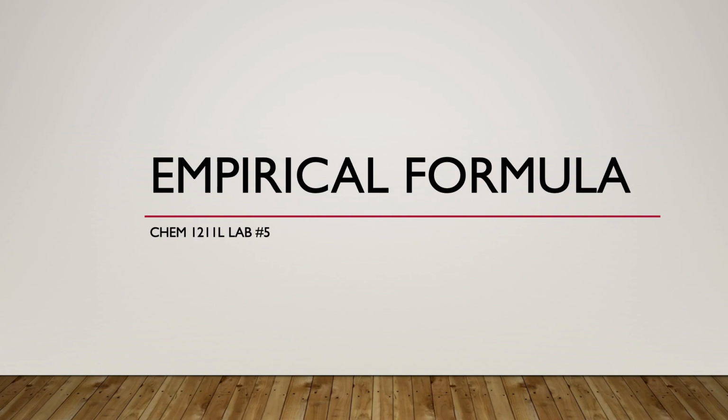All right, welcome to our third experiment of the semester for Chem 1211 lab here at North Georgia. This is experiment number 5 on the CSE Pub site, the empirical formula lab. So this week's lab, we are going to be trying to determine an empirical formula for magnesium oxide.